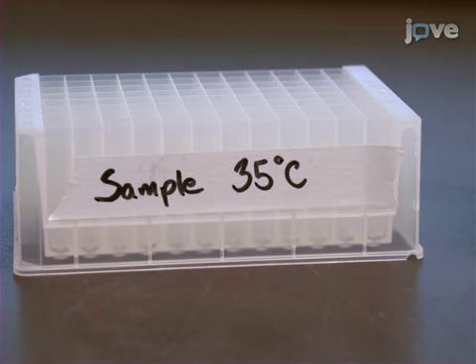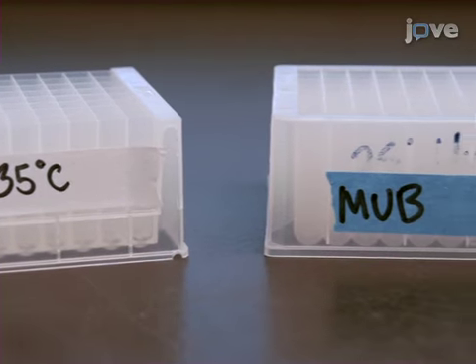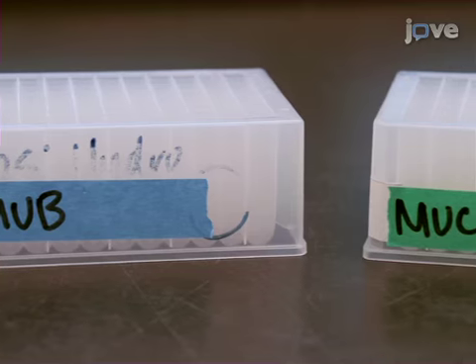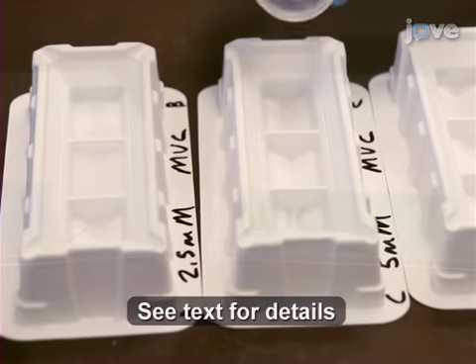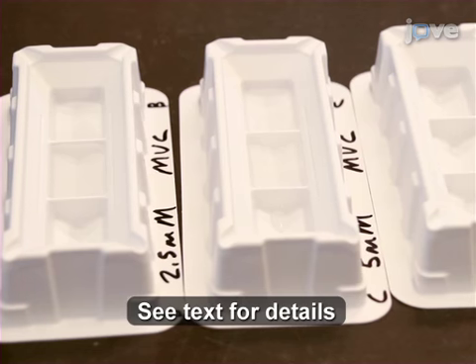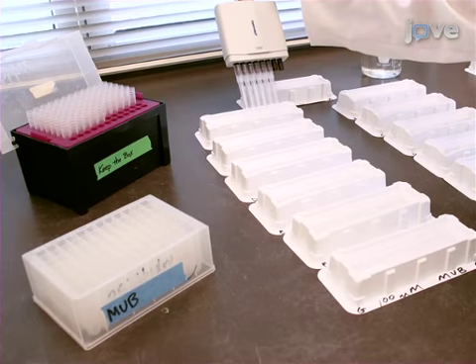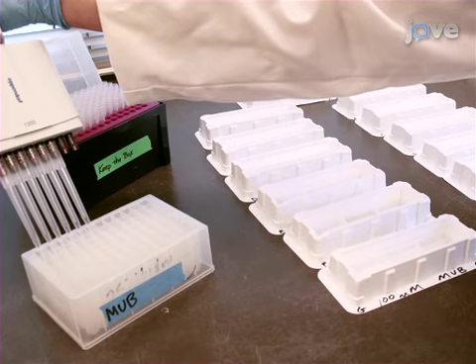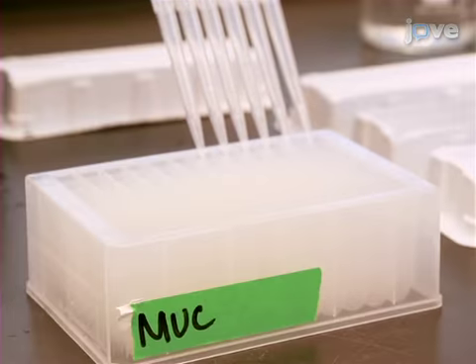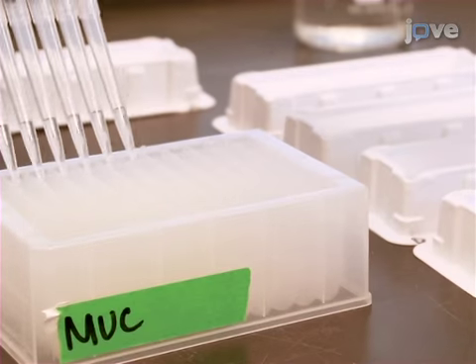To begin assay setup, label 3 deep well plates as sample, MUB standard for 4-methylumbiliferone, and MUC standard for 7-amino-4-methylcoumarin. Pour each standard and substrate into separate clean, pre-labeled reservoirs oriented in rows. Then, pipette the appropriate MUB standard into corresponding wells of the MUB standard plate as listed in the text protocol. Repeat this process for the MUC standards into corresponding wells of the MUC standard plate.